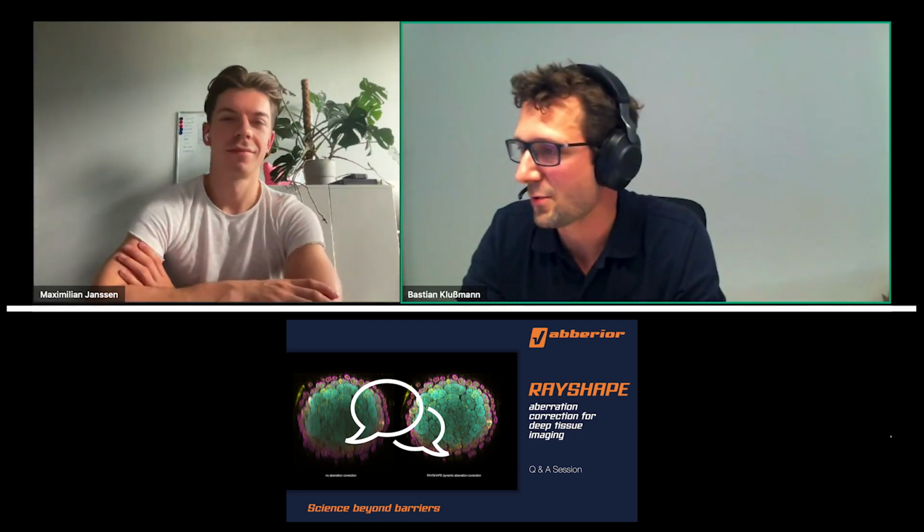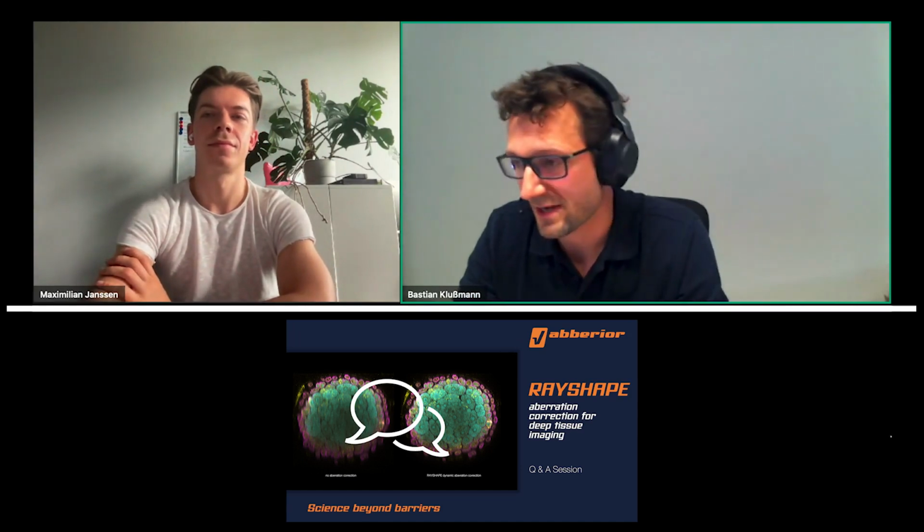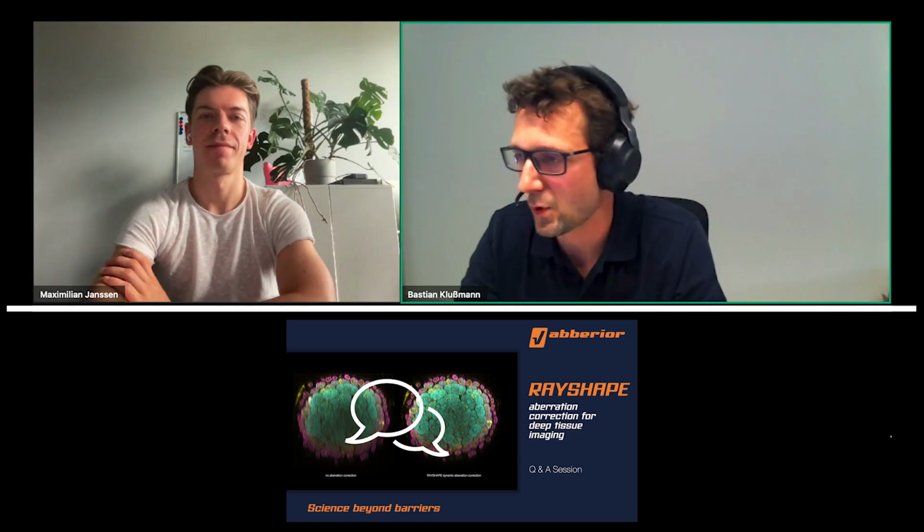Thank you very much for your attention. I hope we could show you the beauty of adaptive aberration correction. And as I said already several times, it's really easy to use. You set this up at the beginning of your session, and it works all the time.